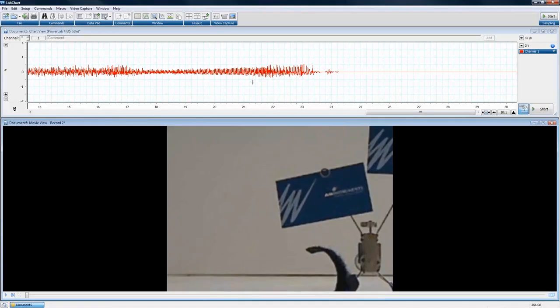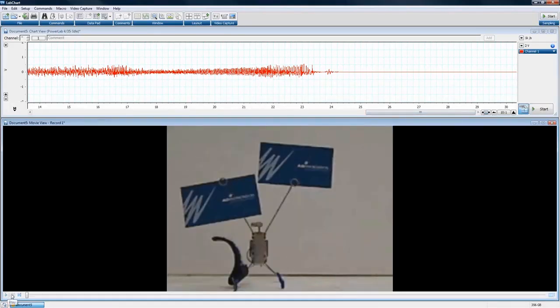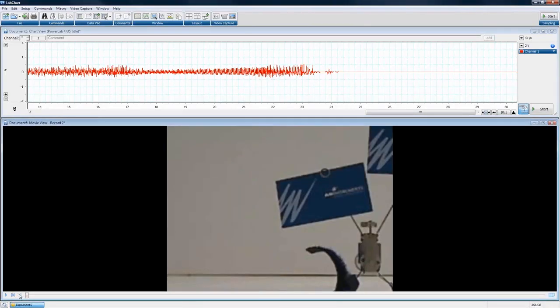Make this a little bit larger. And you can see here that now I can actually advance to the beginning of the next file. This has become active. It's not grayed out anymore. So I can move to my next file, which moves to my next block.